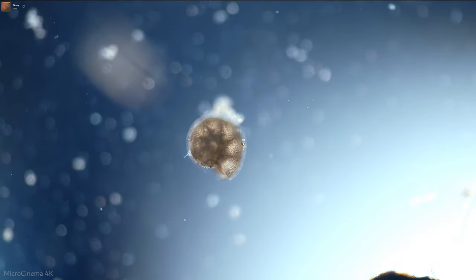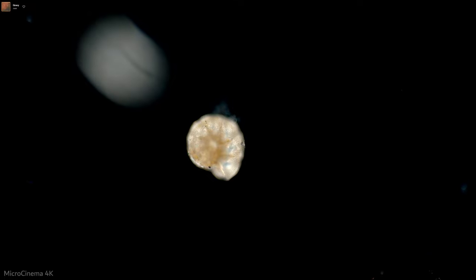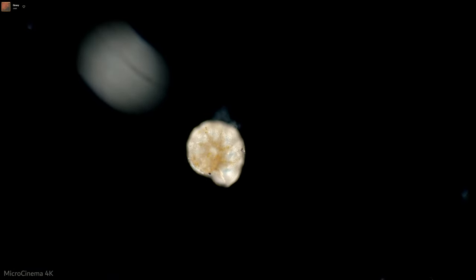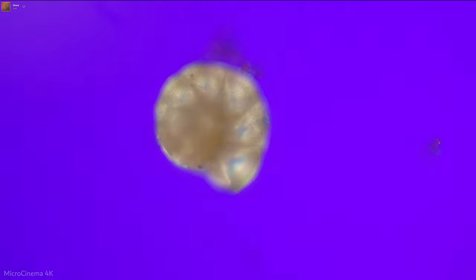So this is a Foram. Or at least the shell of a Foram. I'm not sure if anybody's home. I wonder if this thing has a polarized light response. Let's check on that. Oh yes, it does indeed have a polarized light response. Wow, it is quite bright in polarized light, actually. Very shiny. And then let's see what happens when we hit it with the wave plate.